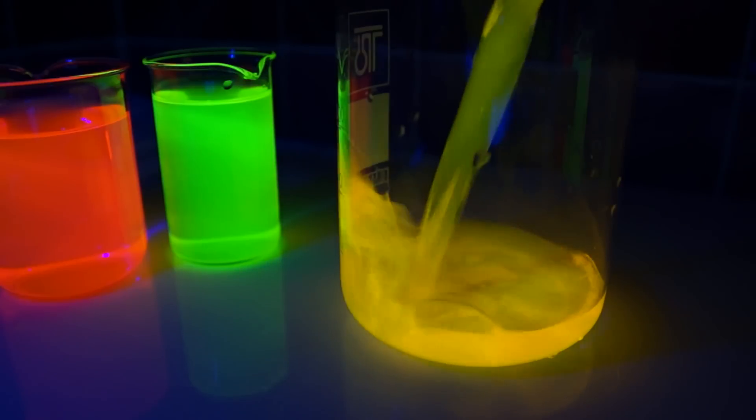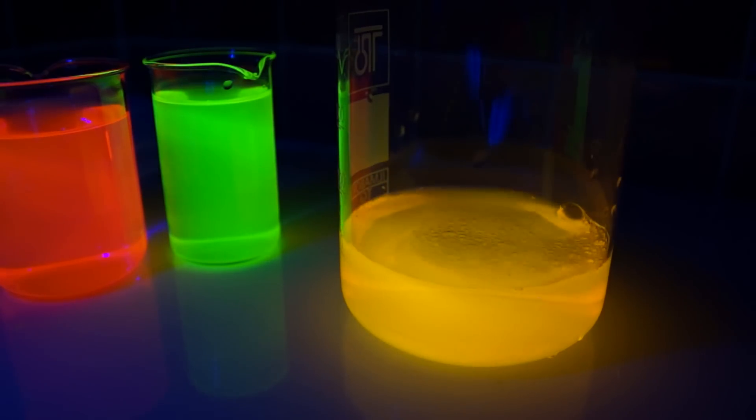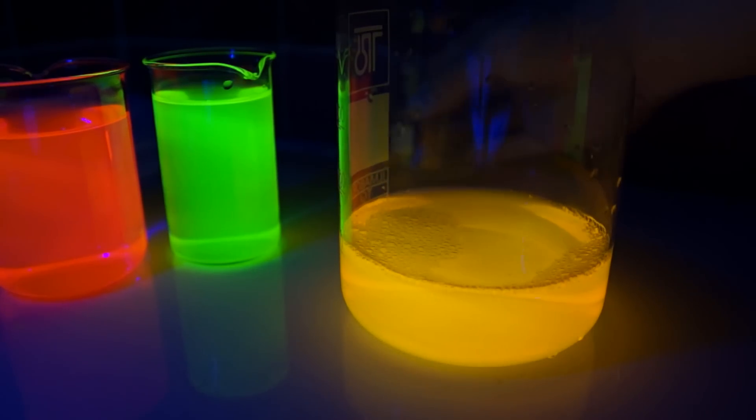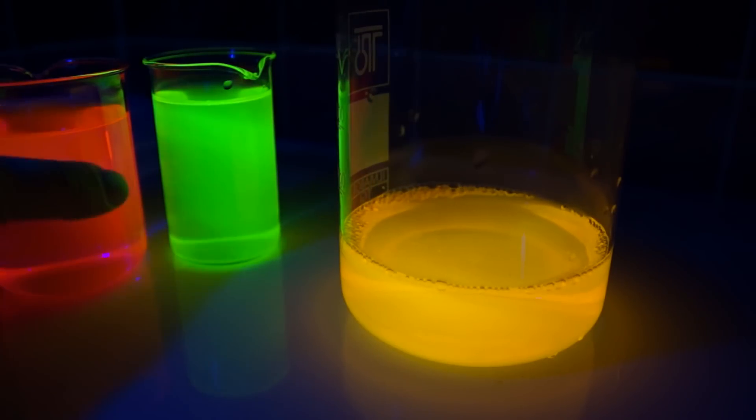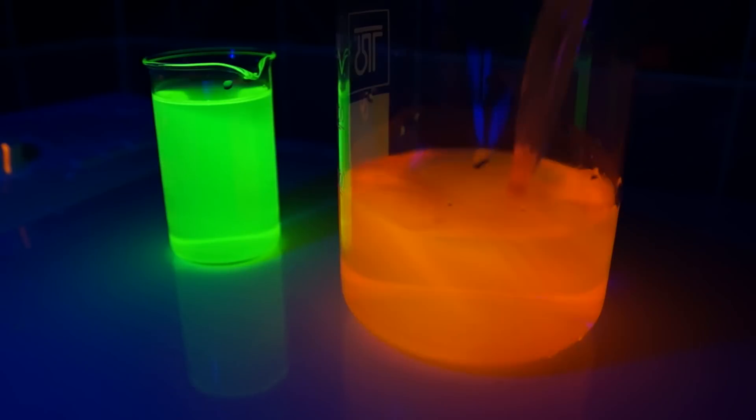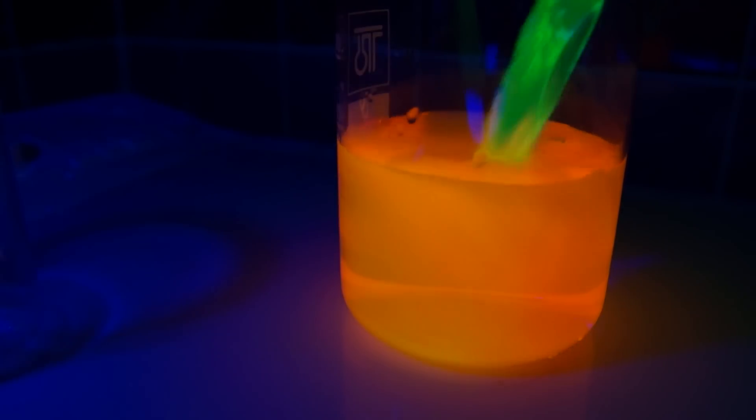Let's try and mix several different solutions of fluorophores and see what color it will obtain. First I pour Rhodamine-6G which is yellow. Next I pour Rhodamine-B. The solution turns orange. Finally I'm topping it up with a solution of Fluorescein.